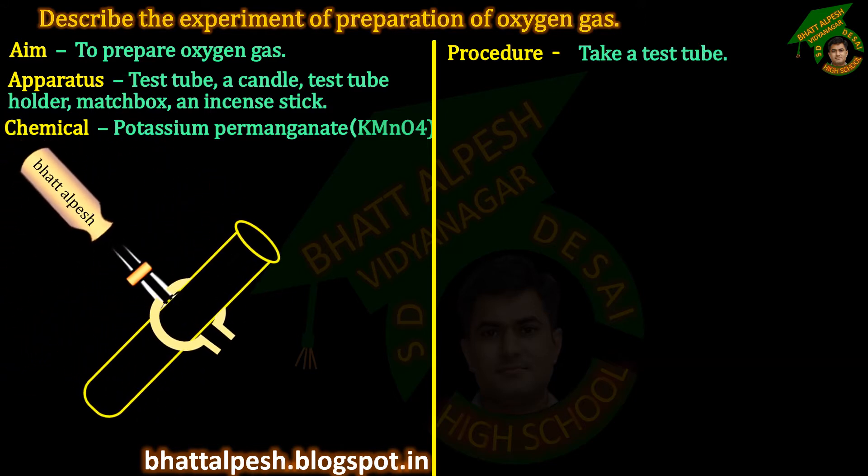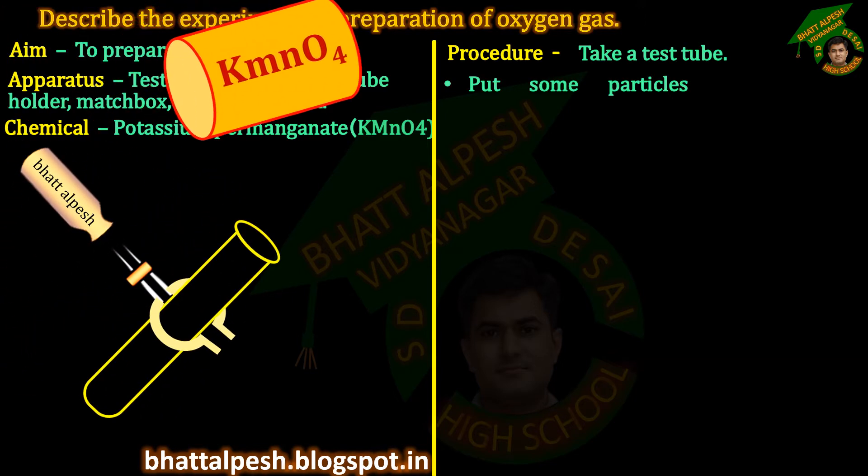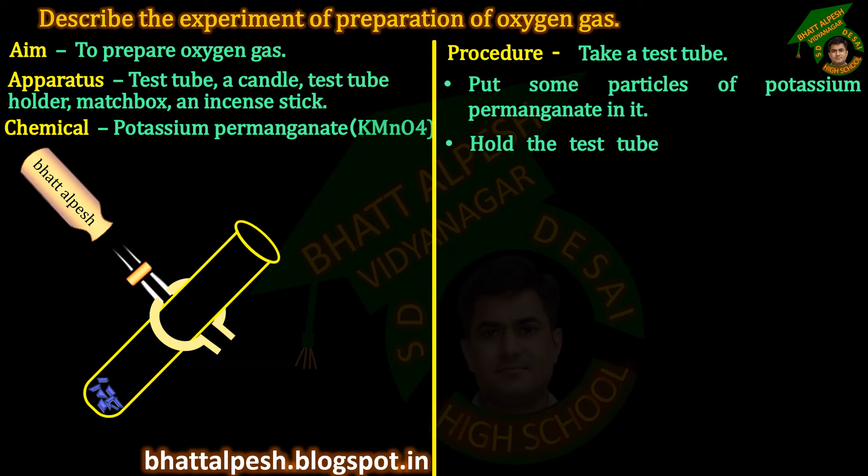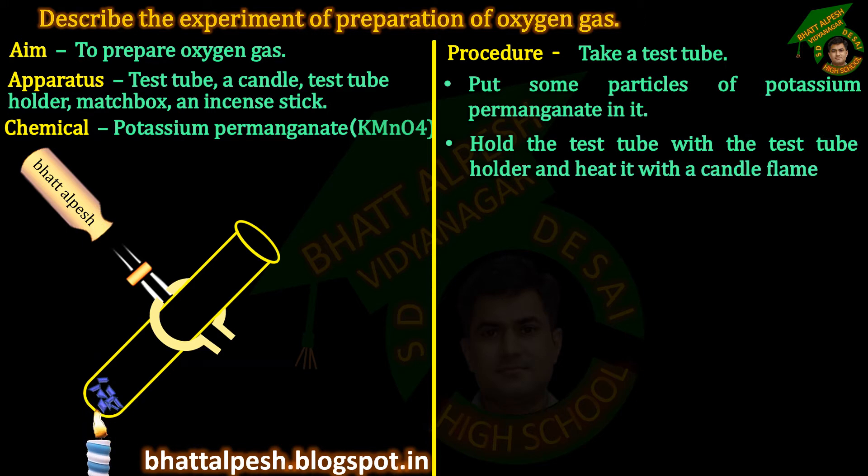Procedure: Take a test tube. Put some particles of potassium permanganate in it. Hold the test tube with the test tube holder and heat it with a candle flame.